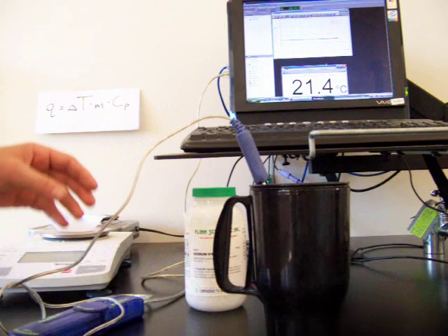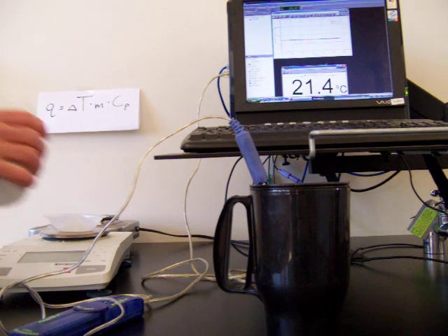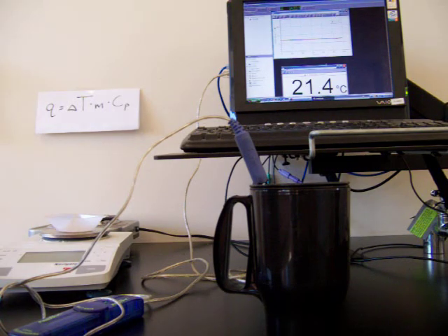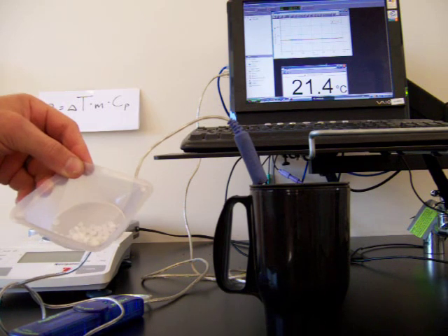Now we're going to dissolve some salt in the water. We'll start with the sodium hydroxide, so I'll measure out a small sample of sodium hydroxide. I'm weighing it on my electronic balance. I have 6.28 grams of sodium hydroxide. It's an ionic compound — a solid right now.